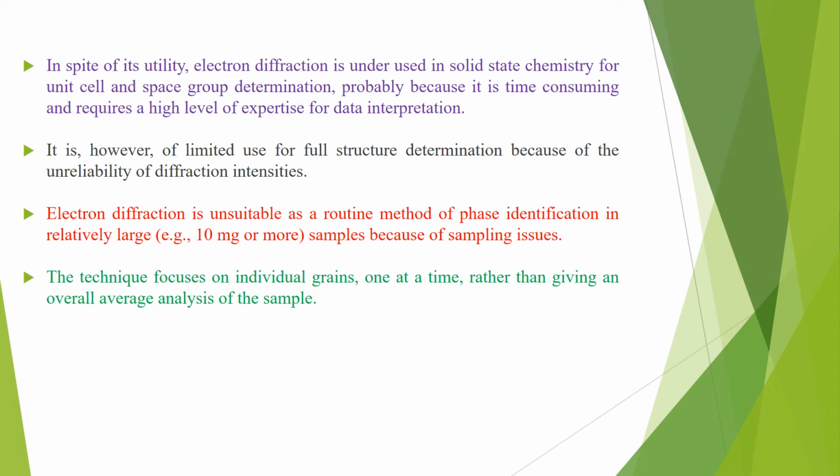And in the absence of direct unit cell and space group information, powder XRD patterns may be indexed using various trial and error procedures, but there can be uncertainty in the result obtained, especially in cases where a superstructure may be present that shows up only weakly in the powder XRD pattern.